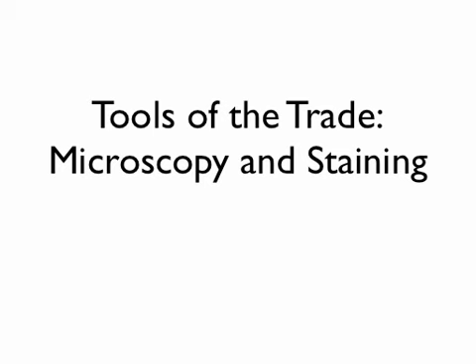We're going to talk about microscopy and staining. So this is tools of the trade, tools that we use in studying microbiology. Hopefully, most of this material will be replicating and perhaps going a little bit more in depth into some of the stuff that you've talked about in lab.